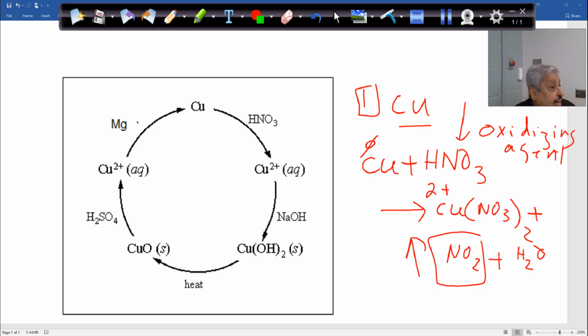Denver is 1 mile high, the highest, I think, in the nation, and they have a problem with this because of the height. They have a nitrogen dioxide problem, which has caused through the years lung cancer in infants. So kids have a lot of problems with this. Therefore, don't inhale this gas. You do this in the hood when you add, and close the whole window of the hood. I don't want you to inhale any of this. This is carcinogenic, so it can cause a lot of problems in your lungs.